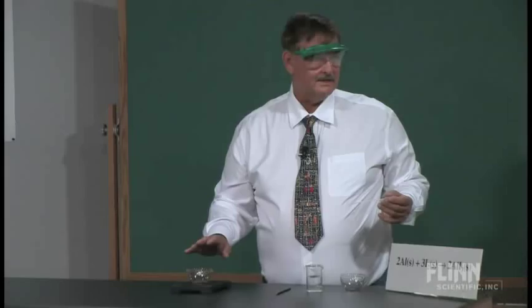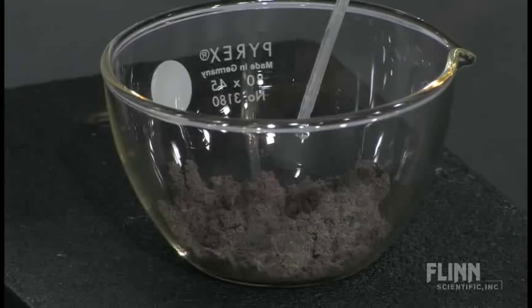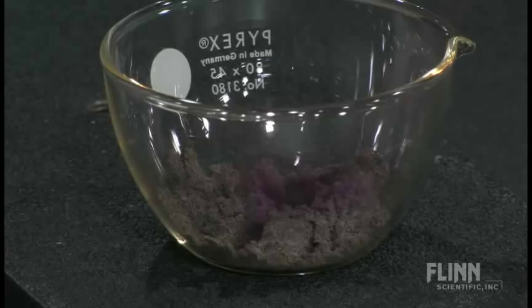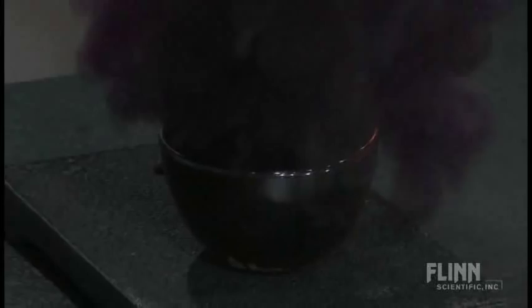So I'm going to add a few drops of water and then stand off to the side. Practicing these things with your colleagues is great. Oh, yeah. And away we go.